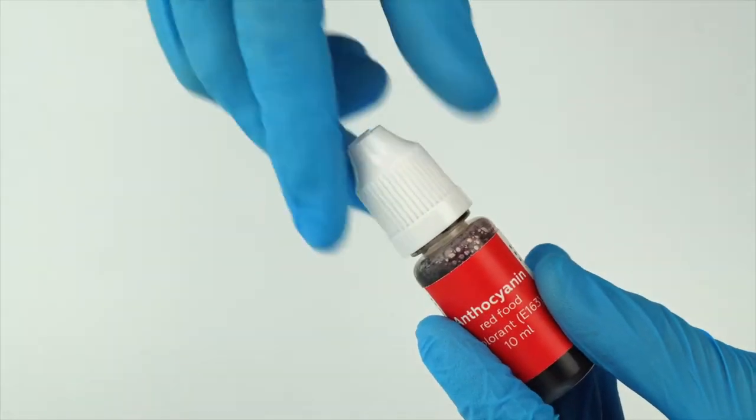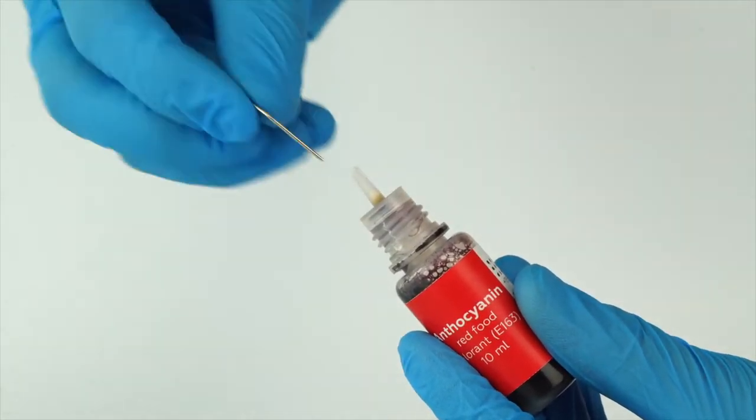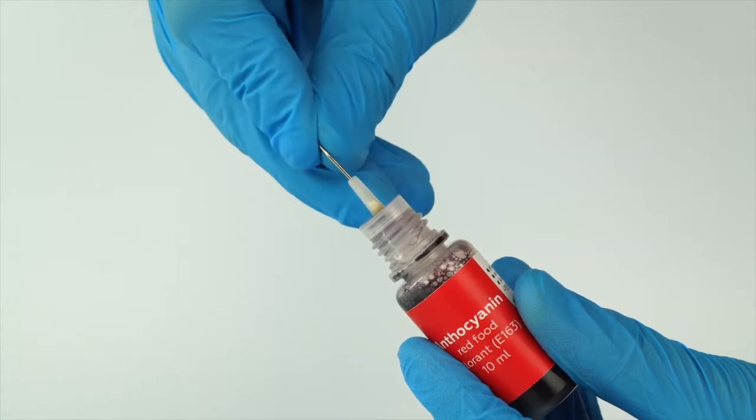To open a bottle containing a reagent, push the cap down and turn it. Pierce the bottle nozzle with an unbent paperclip.